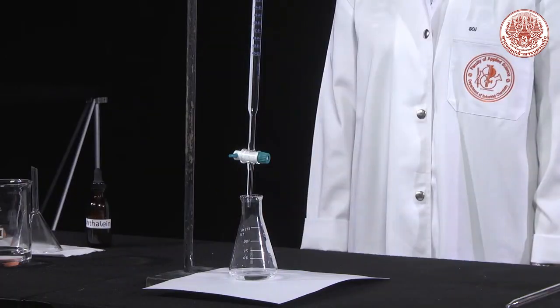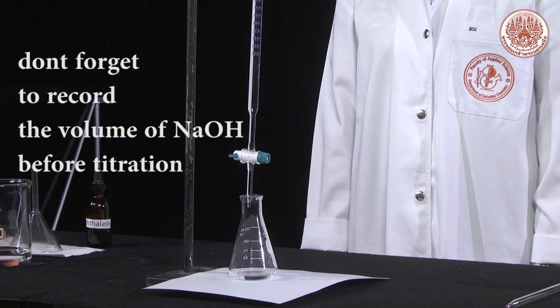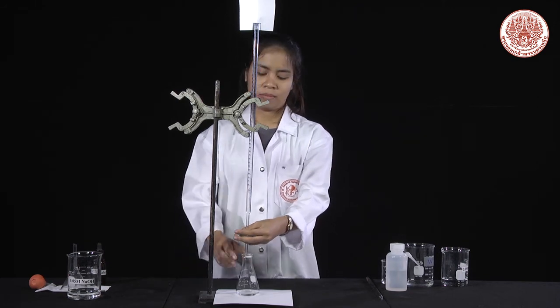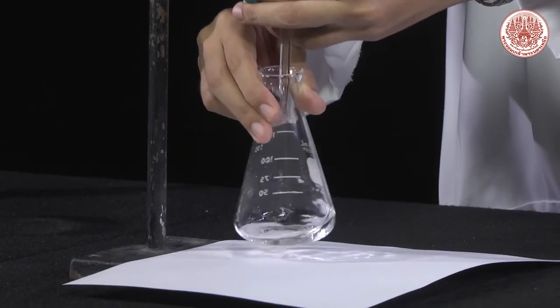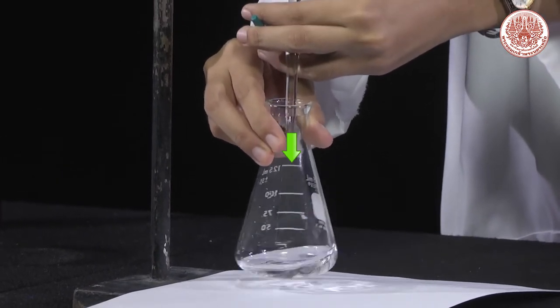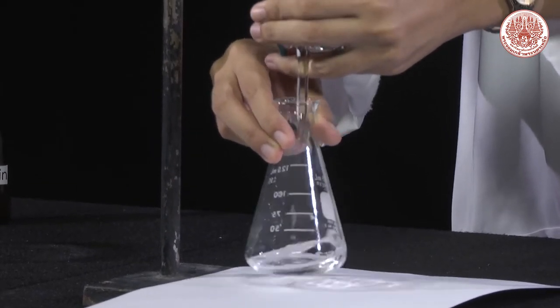Now, students are ready to perform titration, where the burette contains sodium hydroxide solution and the flask here contains acid solution. The titration starts by opening the stopcock and allowing the titrant to drop into the analyte in the Erlenmeyer flask. During dropping, the flask is vigorously swirled.